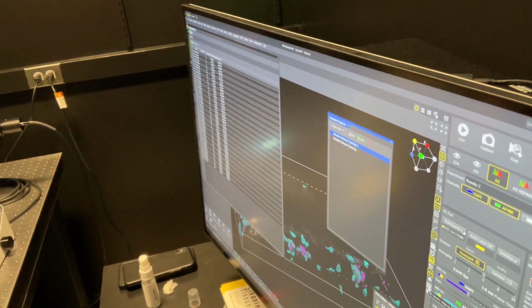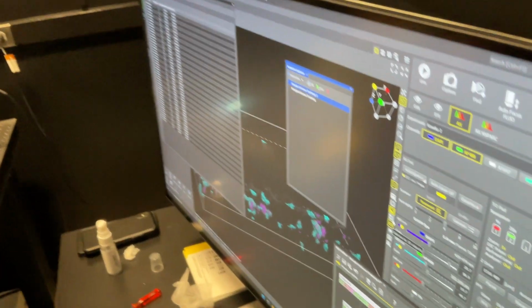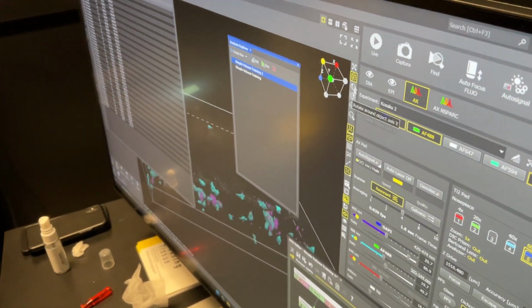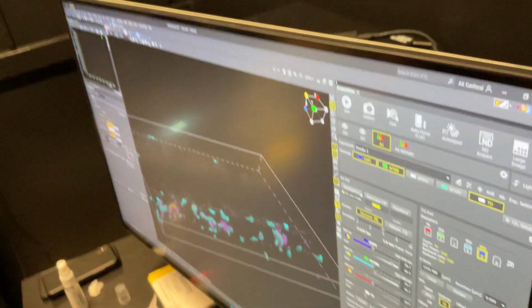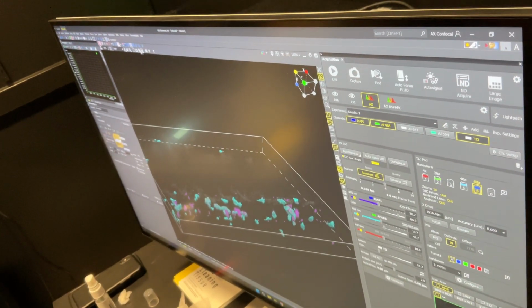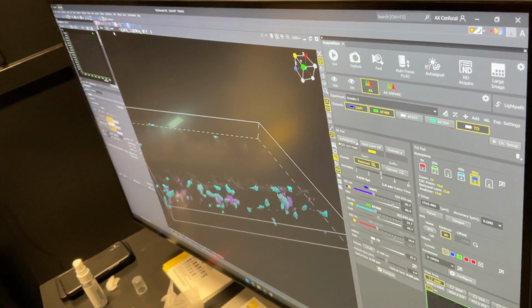Where do we have, in colorize? Where is our... I think we have to step into the advanced for this. The macrophages are red, and I want to distinguish the ones that are infected or not, based on GFP intensity within the macrophages.